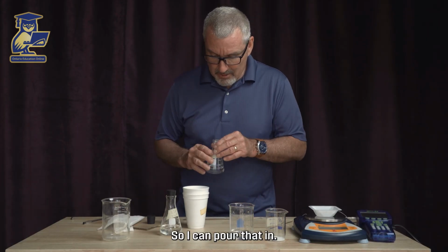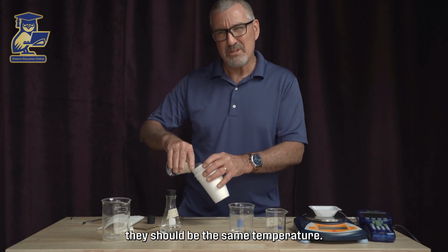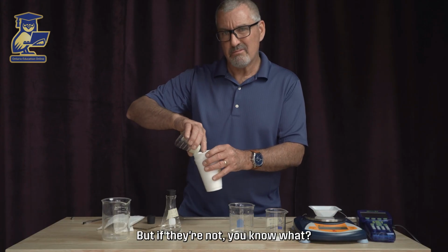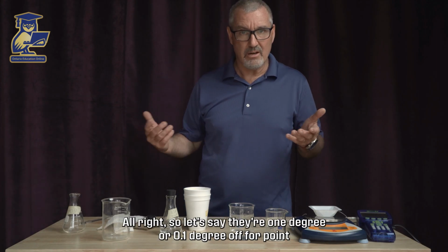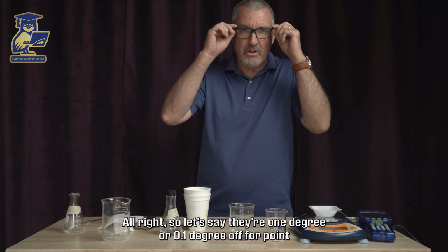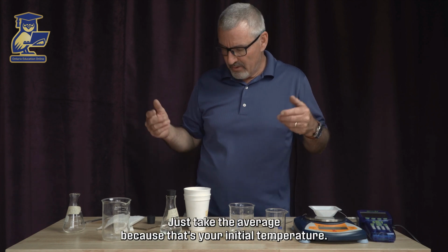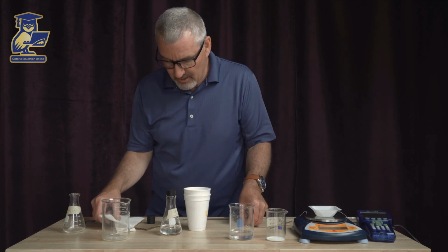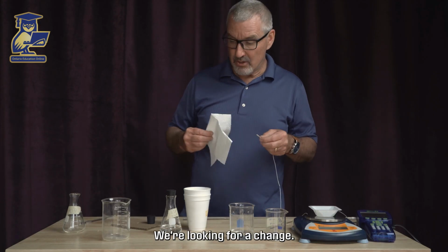So I can pour that in, and these have been sitting together, they should be the same temperature, but if they're not, you know what? Take the average of them. That's okay. All right. So let's say they're 1 degree off, or 0.1 degree off, or 0.2 degrees off. Just take the average, because that's your initial temperature. Because remember, we're looking for an enthalpy change. We're looking for a change.